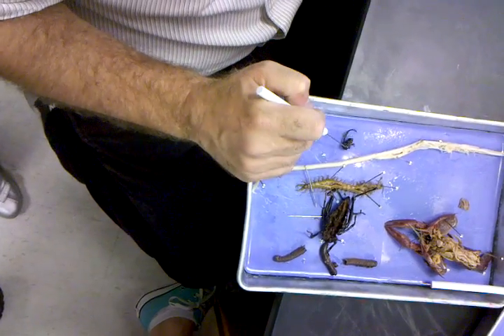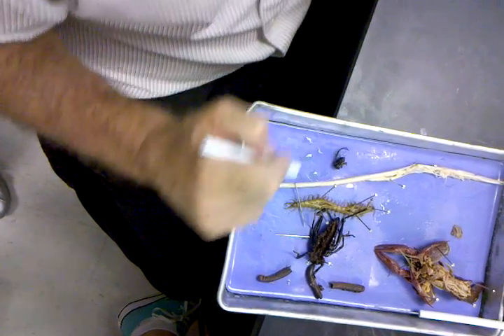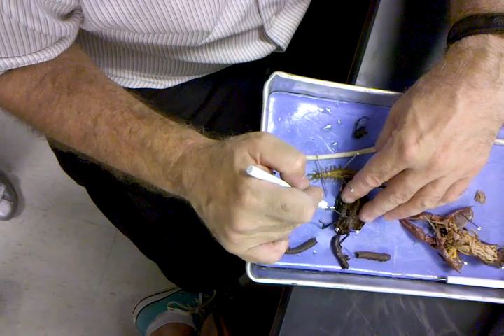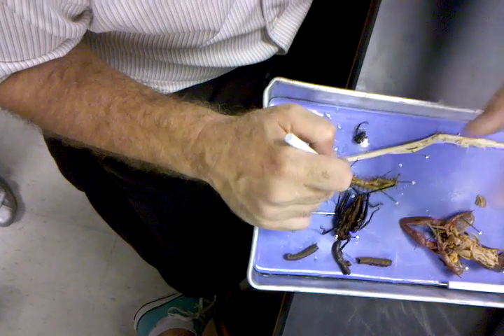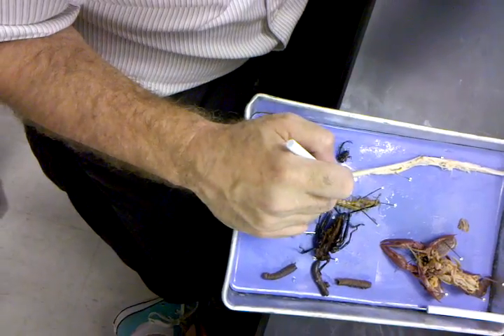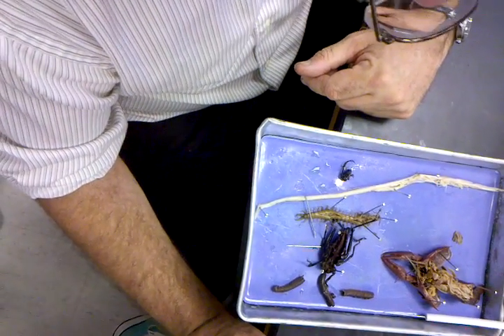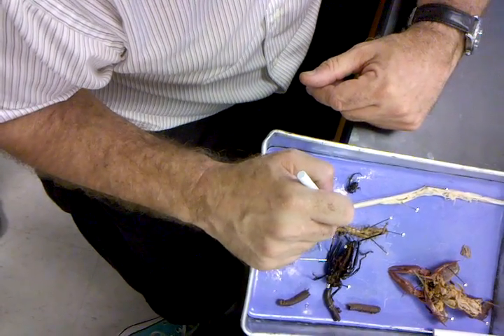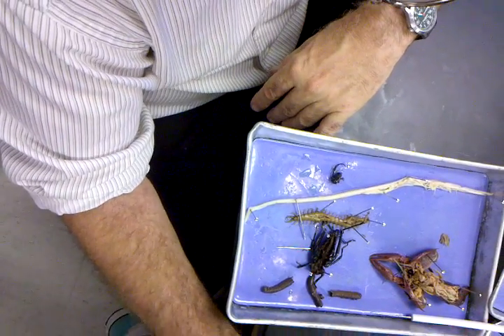Let's see if you're paying attention. What's that? What's that? Anus, rectum. What's this? Femur. Tibia. Got it? What about the ovipositor? If we had a female — part of the problem is they're all males, and the male has got a blunt end — the ovipositor would be a bifurcated or forked structure in females.